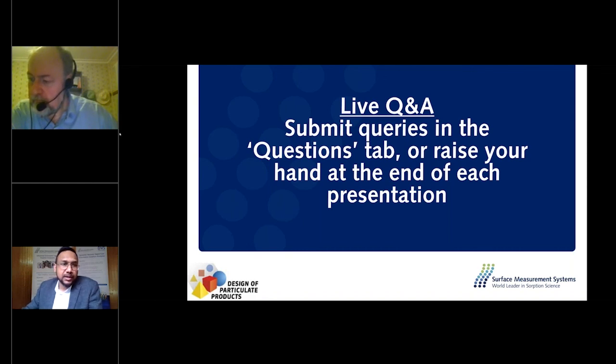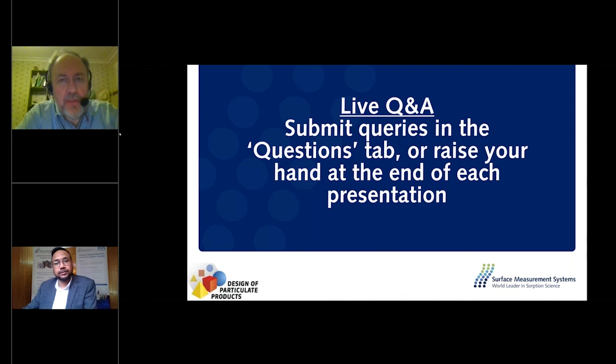Thank you. The next question is, could the theory of IGC be applied to liquid chromatography? Could surface area and surface energies be measured by using liquid probe molecules? The short answer is yes. Certainly, we've done some work on determining surface areas using inverse liquid chromatography. But there's no reason why you could not do surface energies as well.